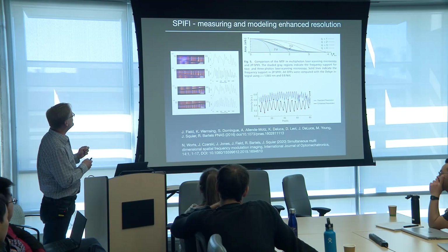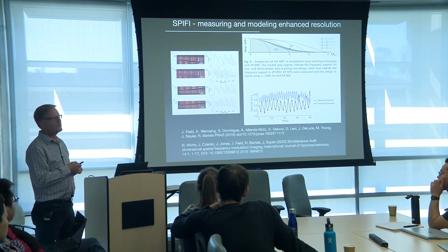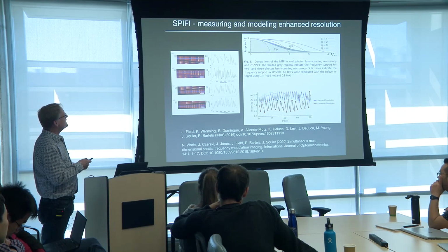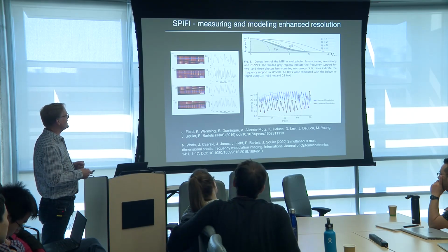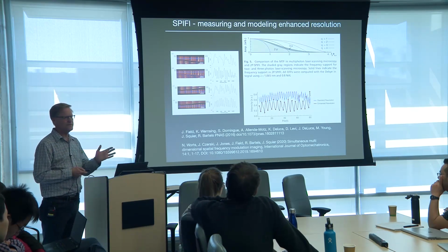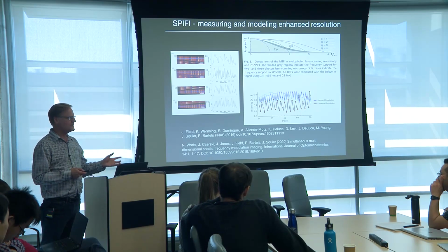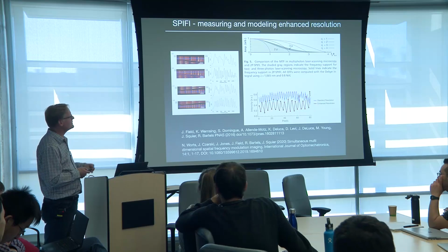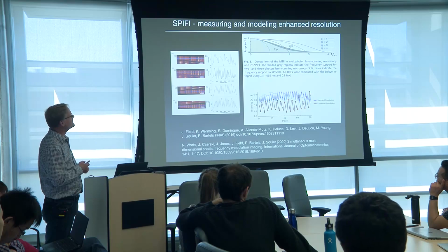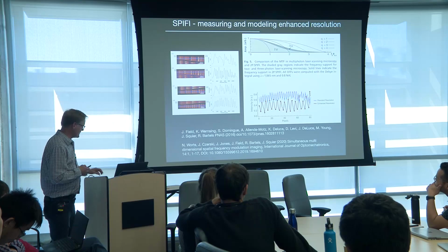So this would be our first order image, and there's the second order image, which shows that we get the improved cutoff frequency, and then you get the doubling of the number of points that you're able to sample. So at this point, I think we've gone through about every iteration that I can possibly think of in terms of trying to characterize and really show the gains. And we've calculated it and put it in tabular form against all the different modalities that I can think of to show you how it compares as well.